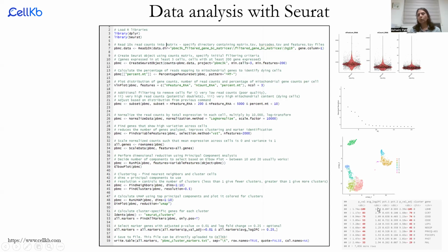Using these four steps, it's straightforward to come up with the list of genes, which you can now use for annotation. And the Seurat tutorial is actually very good. So please try it if you haven't tried it yet. It will give you a lot of flexibility in terms of identifying what resolution you want for your clustering and what the filtering criteria are.